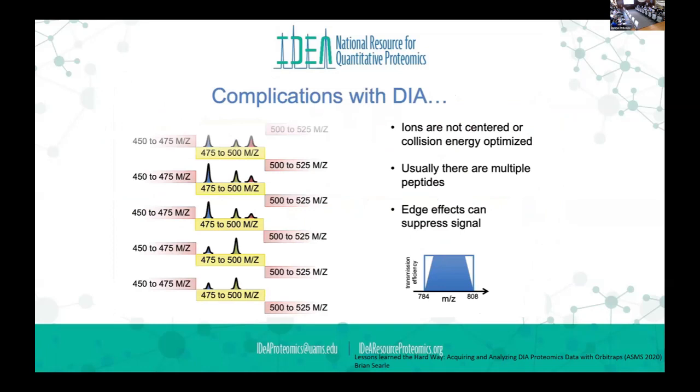There are some complications with DIA. One is that you're dealing with ions where you're not optimally fragmenting everything. And that's not as bad of a problem as I thought it was going to be. Under-fragmented ions are actually kind of nice because sometimes you'll have a larger Y ion, sometimes a B ion, but mostly a larger Y ion that gets you into mass space, or mass to charge, or Thompson space. The Thompson as a unit came out when I was in school, and so I struggle to remember that Thompson's a thing. I've just gotten out of the habit of saying daughter ion, and I now say fragment ion all the time, but I forget about Thompsons. But it pushes you to a big fragment where the noise is less, and so that can actually be beneficial. Of course, there's multiple peptides, and so the complexity is there.